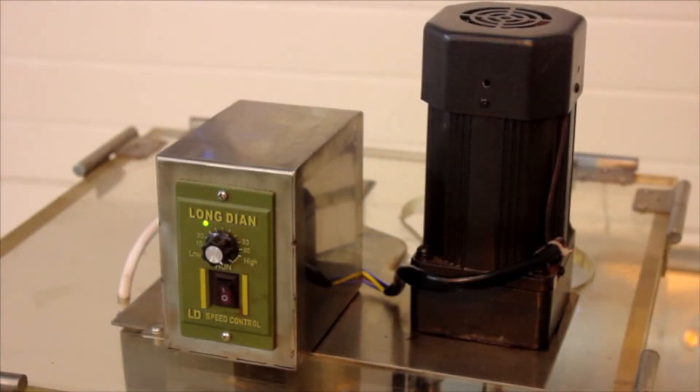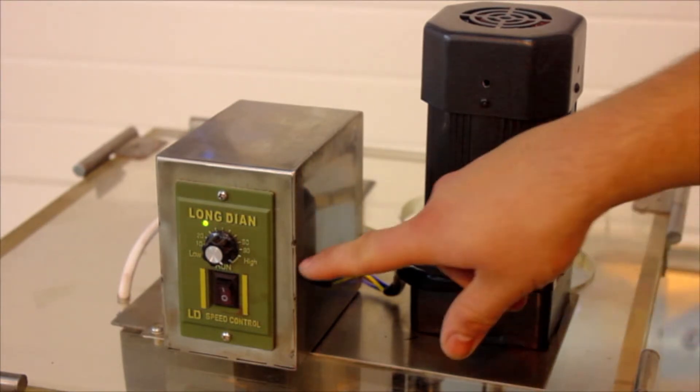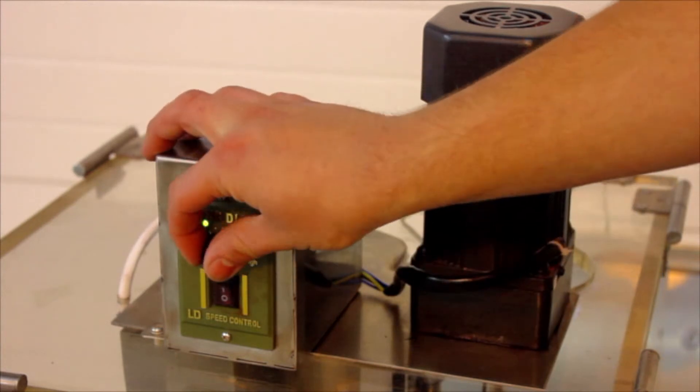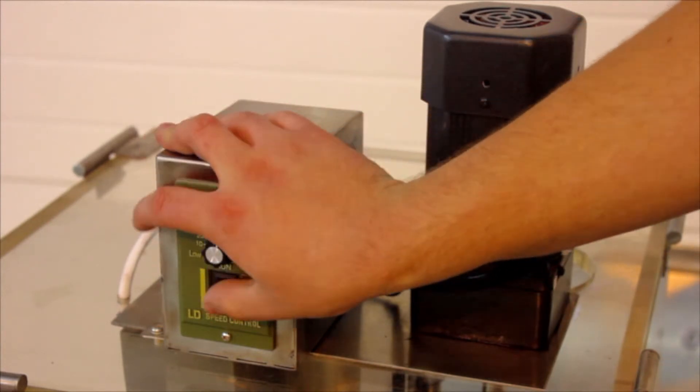The RTP 5, 7 and 9 come with an optional extra force feeding system. This allows for a more consistent tablet weight. The force feeding system is controlled through this small panel on the top of the machine and has adjustable speed and an on off switch.